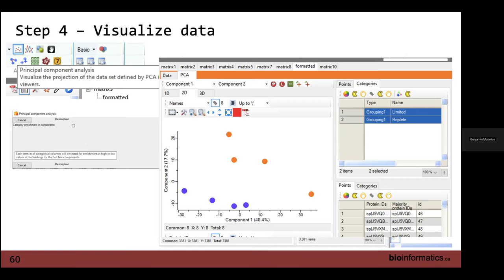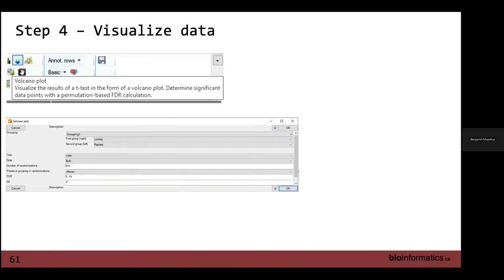All right. Another thing is volcano plots. Volcano plots are very good for giving us an idea of what's changing on the whole proteome scale in terms of individual proteins. So again, this would be with our protein matrix clicked, with all of our individual proteins in it. We can go up to volcano plot up here, which is in the same mid top panel on Perseus, and that'll give us this nice dialog box here.